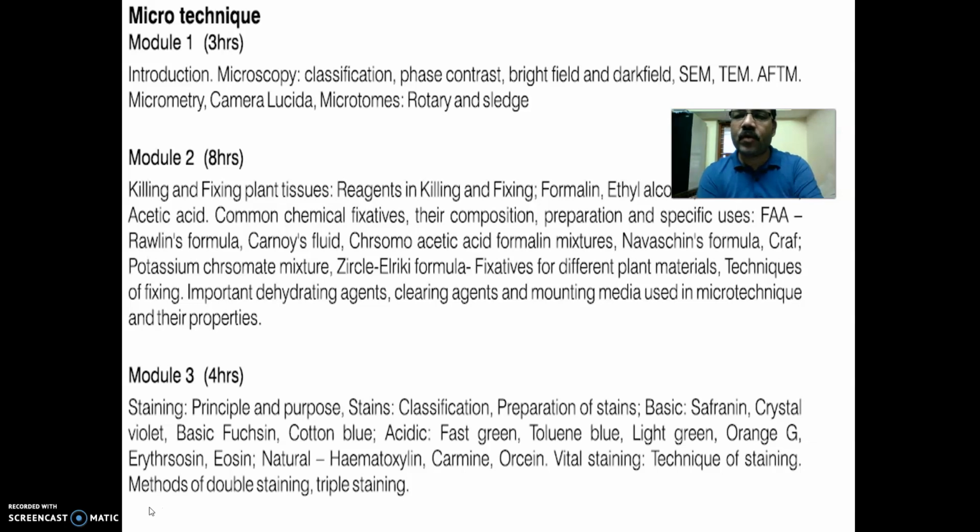Last class we discussed the historical perspective of the microscope. We know that the history of the microscope is very important as far as scientific concepts are concerned. We are living in the world of microscopes, especially the scanning electron microscope and the transmission electron microscope. These microscopes are very popular in present investigations. But you must realize that the present day microscope has evolved over centuries by the great effort of different eminent scientists. Today we are going to discuss the detailed aspects of different types of microscopes.